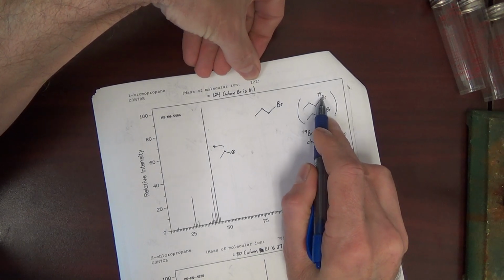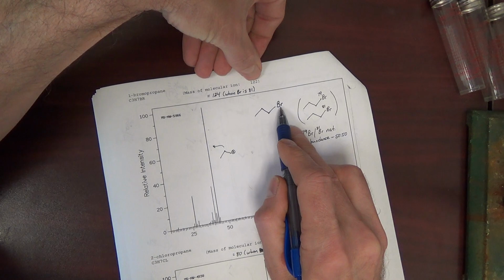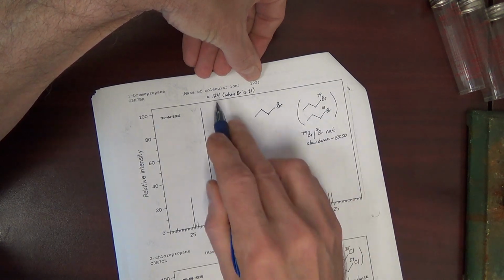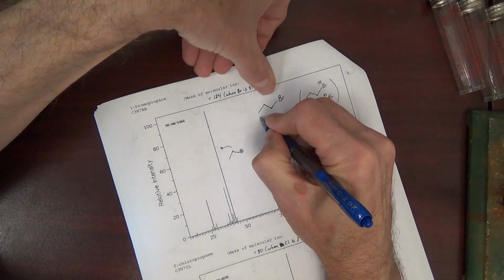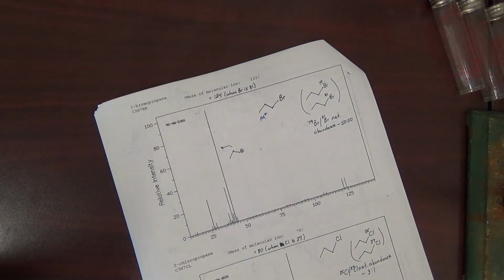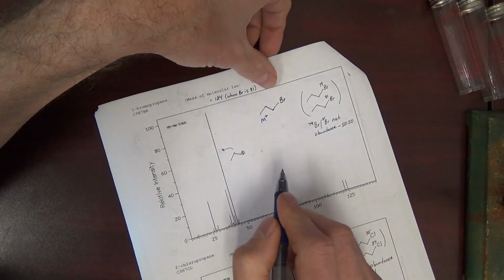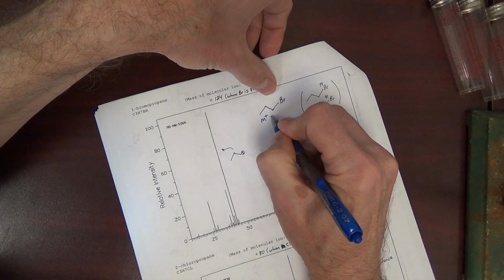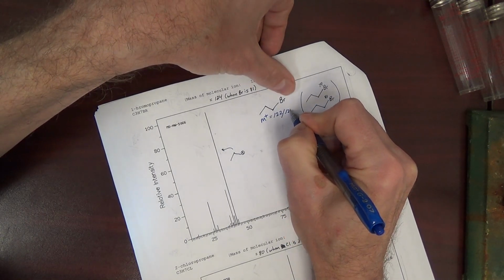When you use 79, all this adds up to 122. But when you use 81, all this adds up to 124. So, the molecular ion, which by the way, a lot of times when we write molecular ion, we don't actually show the radical. And we just call it the M+. But it is a radical. It's going to equal both 122 and 124.